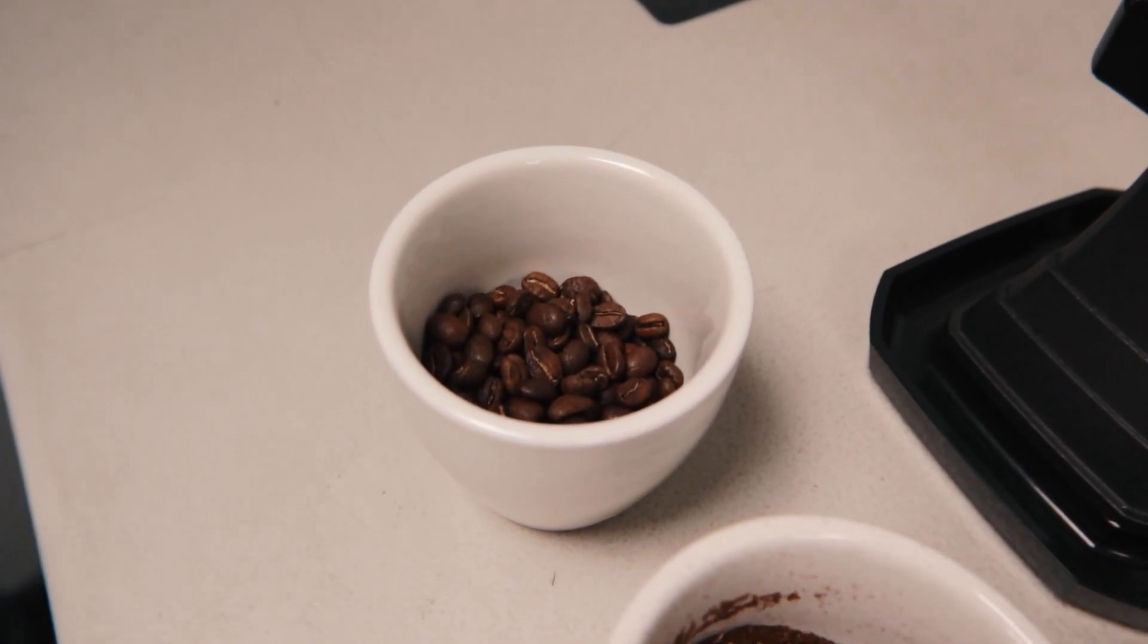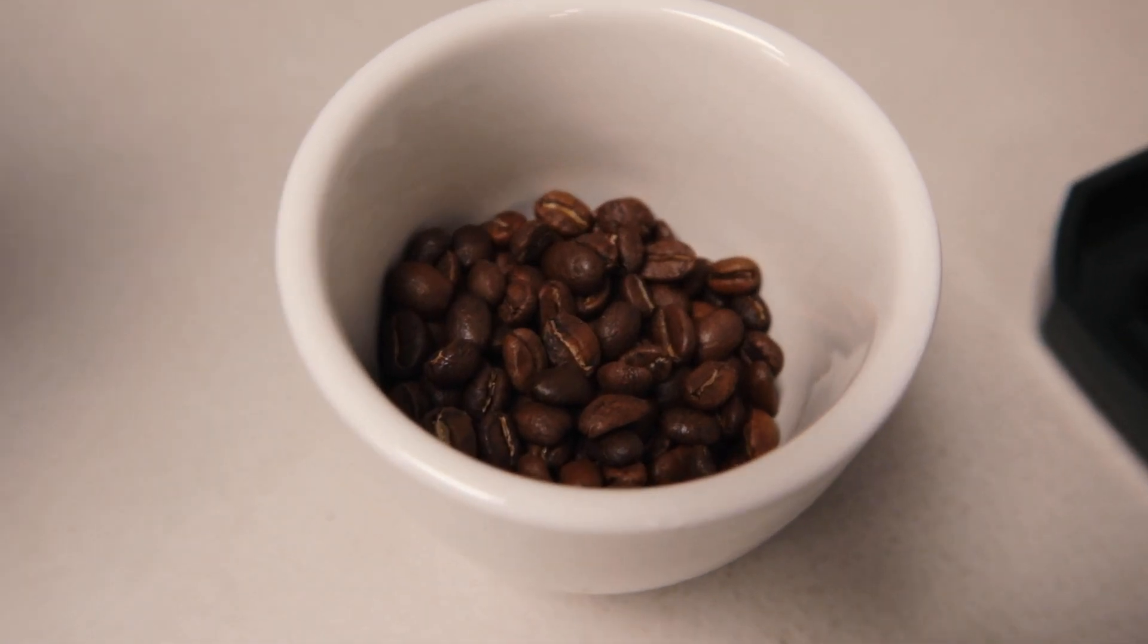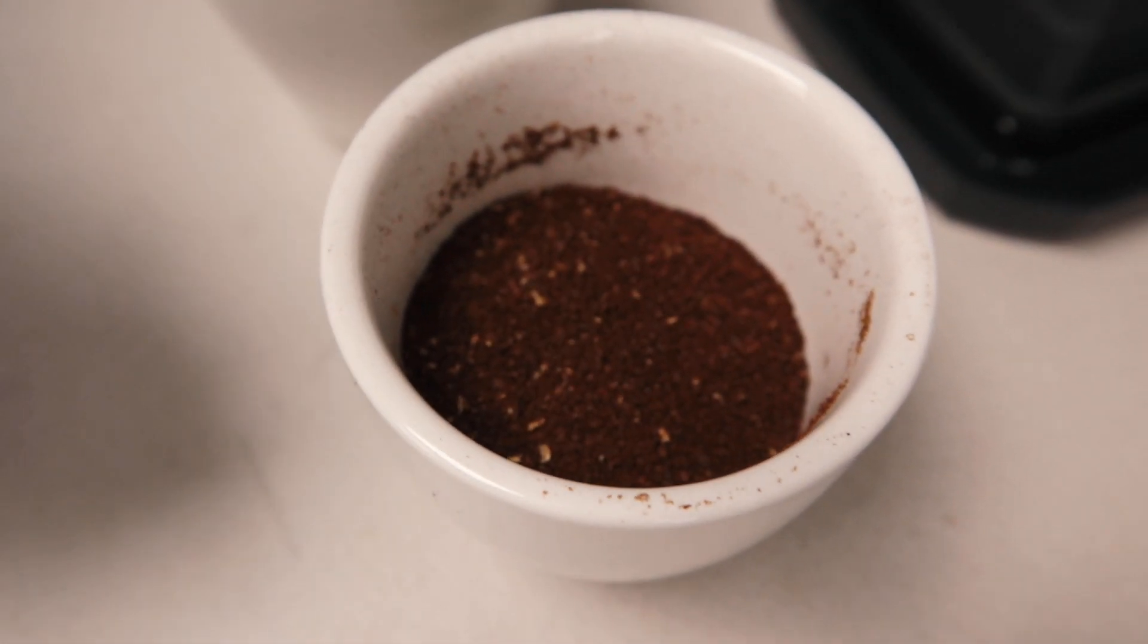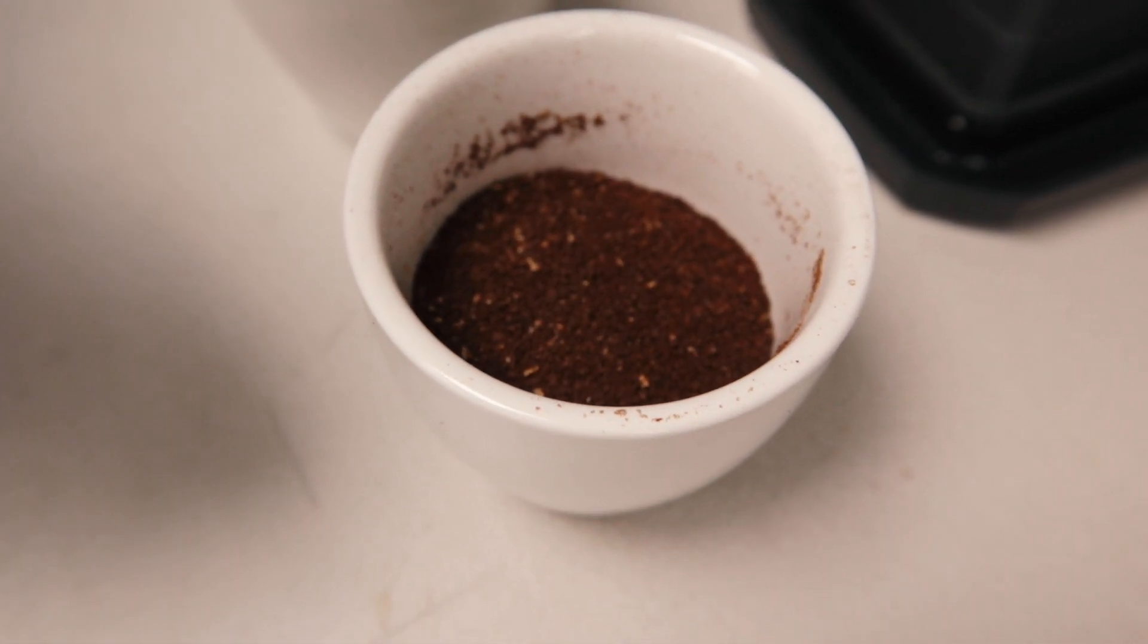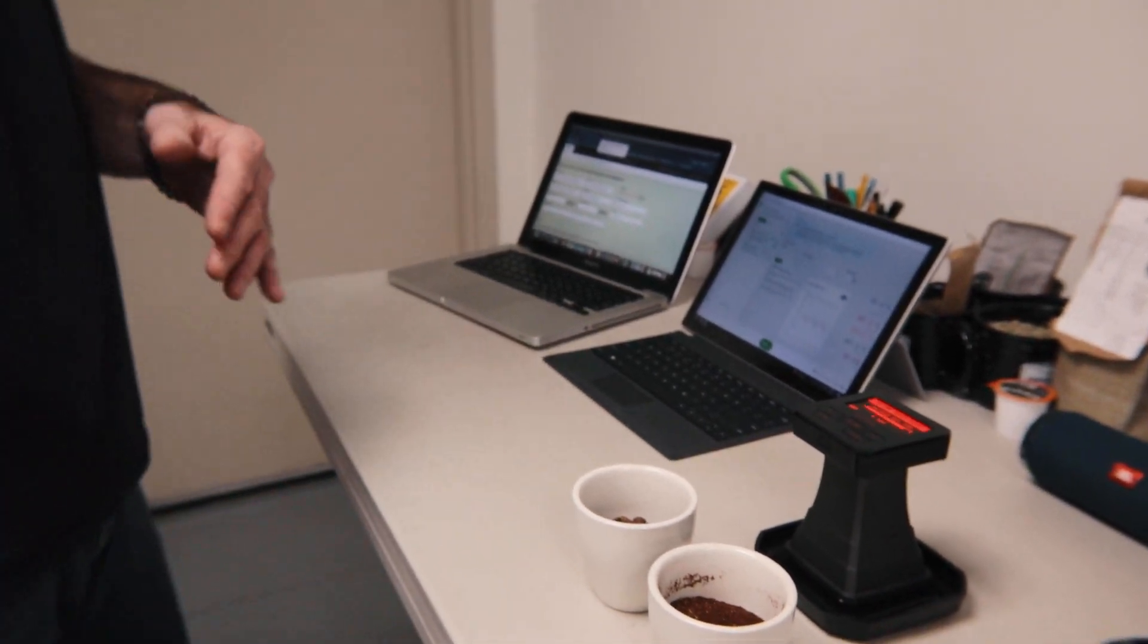Each roast will get measured first whole bean, and then we grind the same coffee, same batch, and we'll measure both.